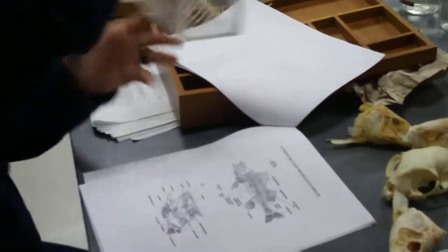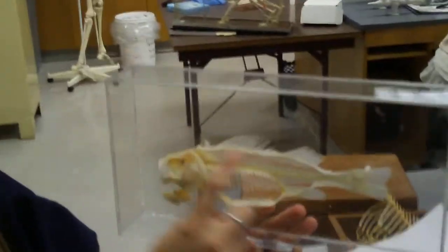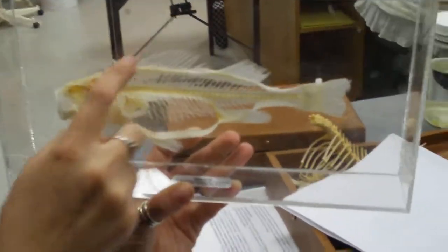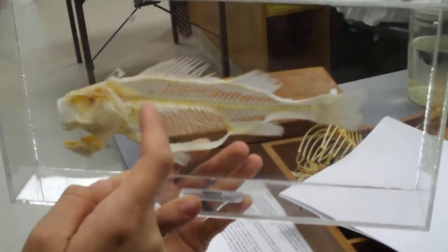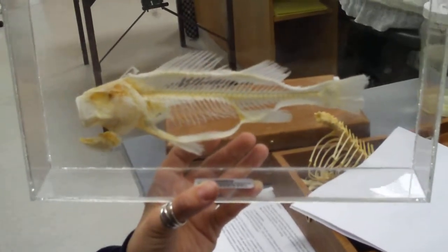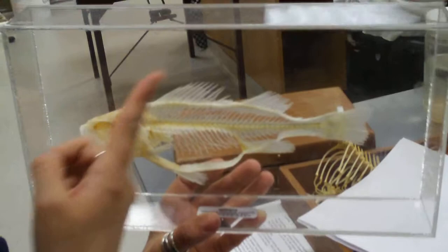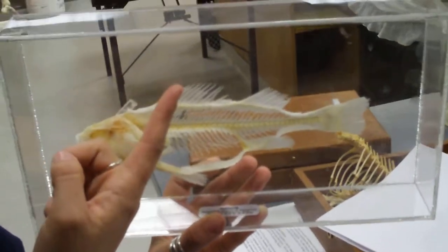Okay, then on to the full body of the perch. You have your spinous dorsal fin and each of those rays, and that's the front one. You'll also learn this when you dissect your perch: it's definitely spiny because it will stab you, it hurts. And each one of those little fin rays is called an actinotrigia.